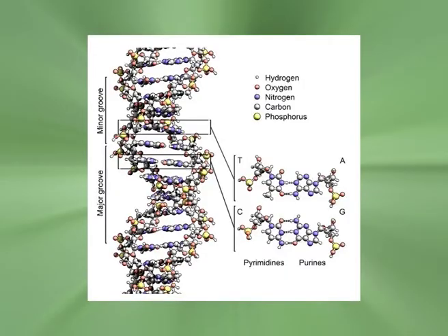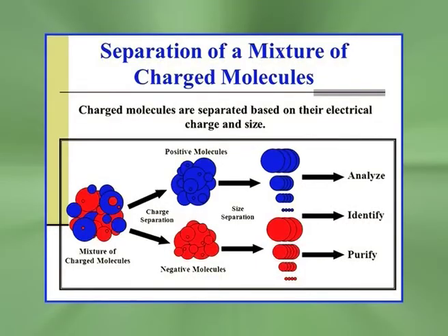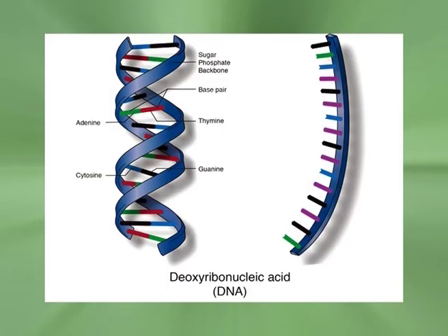However, with periodic changing of field direction, the various lengths of DNA react to the change at differing rates. That is, larger pieces of DNA will be slower to realign their charge when field direction is changed, while smaller pieces will be quicker. Over the course of time, with the consistent changing of directions, each band will begin to separate more and more even at very large lengths. Thus, separation of very large DNA pieces using pulsed field gel electrophoresis is made possible.